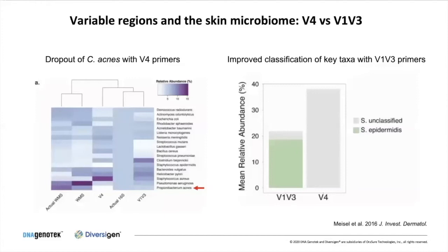There's been a lot of work done in the field looking at the impact of different variable regions on analyzing the skin microbiome. Data from a paper from Elizabeth Grice's lab showed different performance for analyzing the skin microbiome: they saw a dropout of the critical taxon Cutibacterium acnes — or Propionibacterium acnes — when using V4 primers. They also noted that V1-V3, because of its larger target size and increased polymorphisms within the variable region, did a better job of classifying certain taxa. For example, S. epidermidis was classified to the species level with V1-V3 but only to Staphylococcus genus using V4.